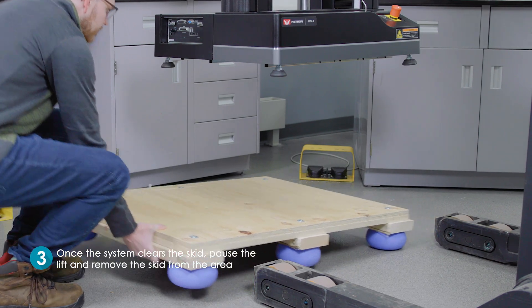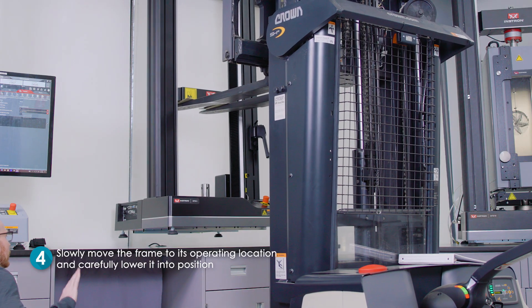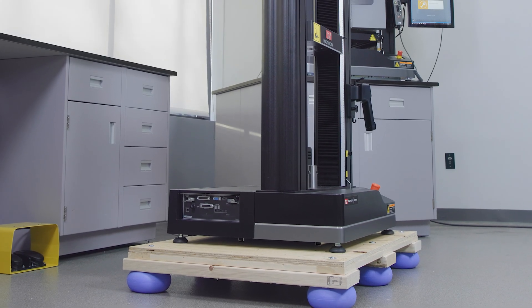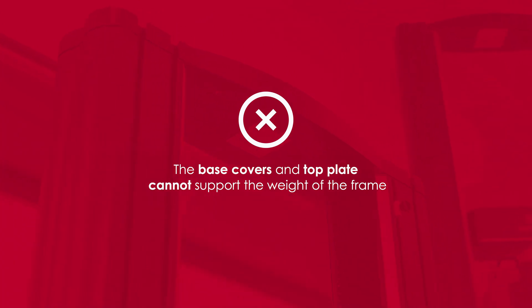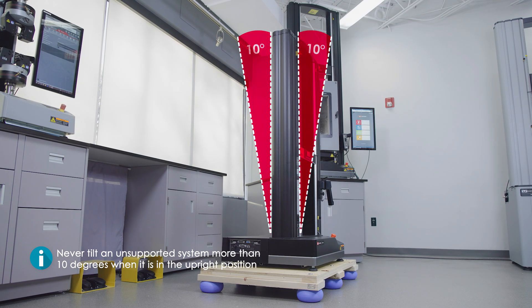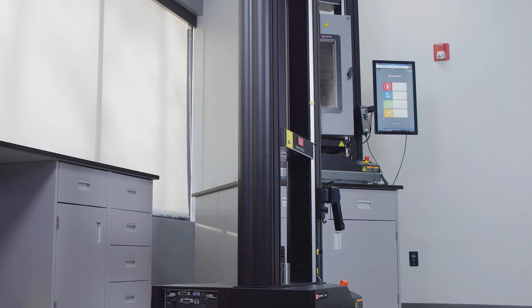Once the system clears the skid, pause the lift and remove it from the area before continuing to slowly move the frame to its operating location and carefully lower it into position. Never attempt to lift the testing system by the base or top plate. The base covers and top plate cannot support the weight of the frame, and attempting to lift the system in this manner may lead to personal injury and equipment damage. Finally, it's important to never tilt an unsupported system more than 10 degrees when it is in the upright position, as doing so may cause the load frame to topple.